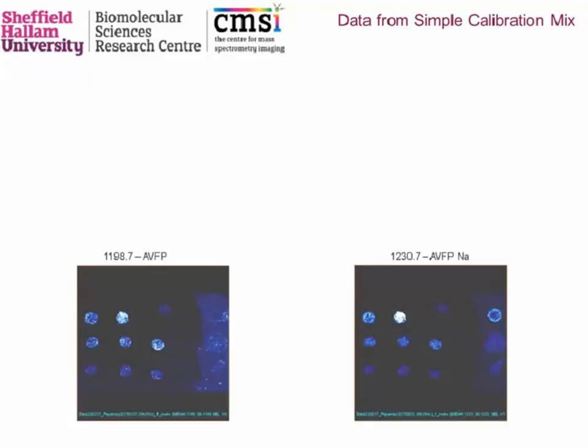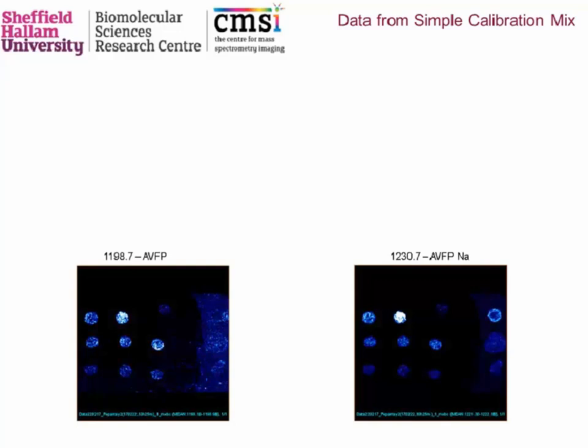And if we use that on the simple calibration mix, you can see here that just by eye we're getting something that looks like a concentration gradient.